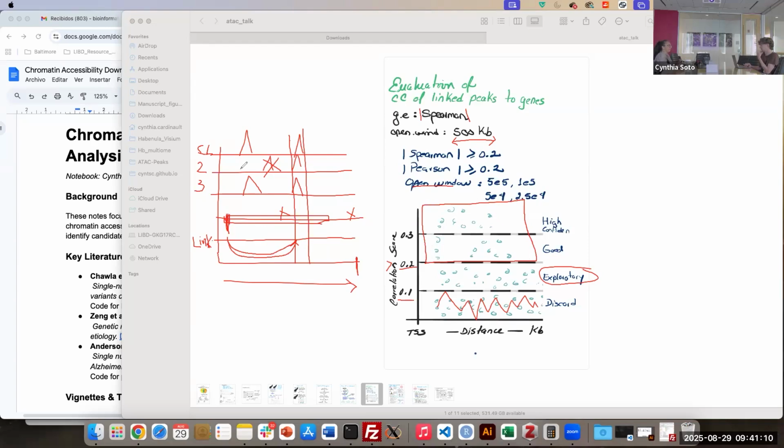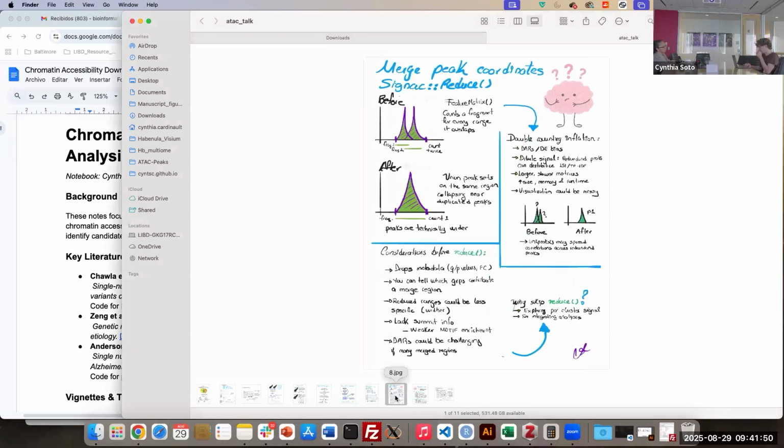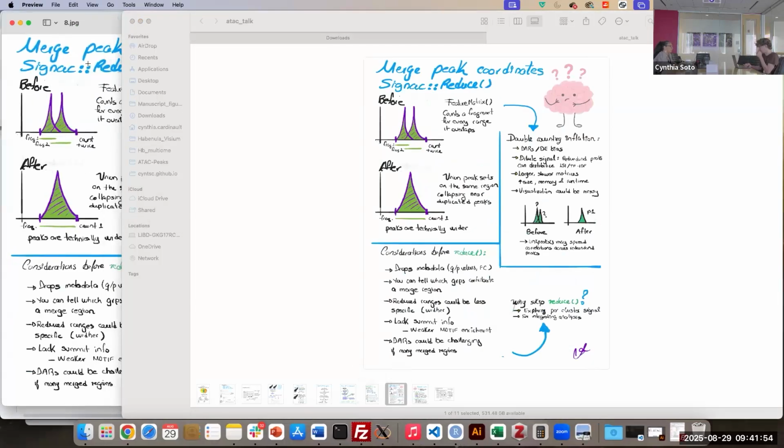So this is very relevant because at any point of the pipeline, you can make tracks. But the question is: are your linked peaks relationships with a correlation score that is suitable for your specific analysis? So you need to evaluate the peaks to know that. Okay, now what is next here? Once we have evaluated our peaks, let's say you don't find the suitable peaks that you want. So what kind of resources do you have available? Well, you have 2 resources. One is that I can merge the peaks. But how does this help your analysis?